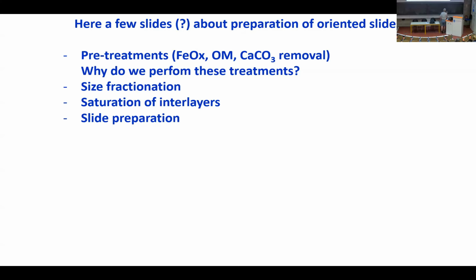So you can always say that I want to remove that, because presence of iron oxide will change the density of my material, which will not be 2.72, but will be 2.73, because I have 0.2% of iron oxide. Who cares? Who cares if in the end you have less than 2.05 micron, or if you have less than 1.95 micron fraction? Nobody.